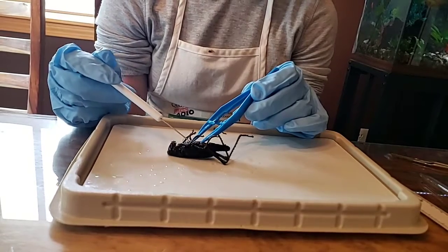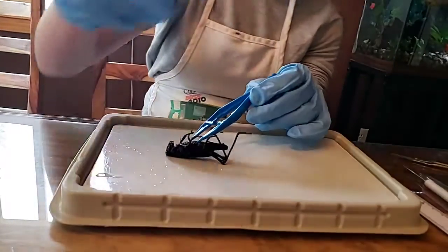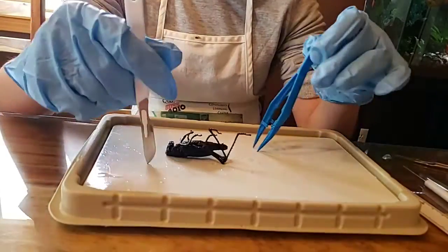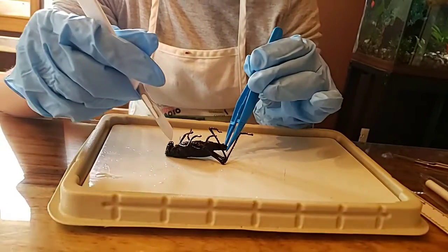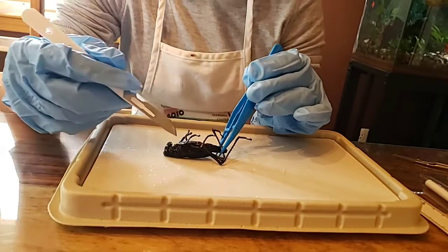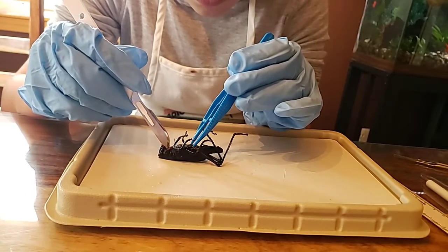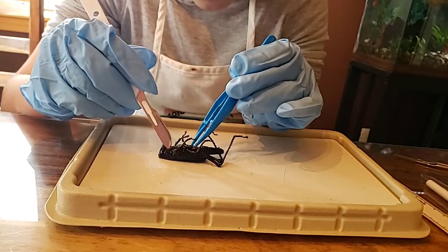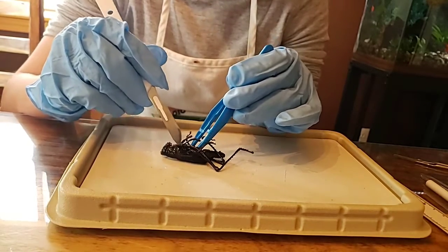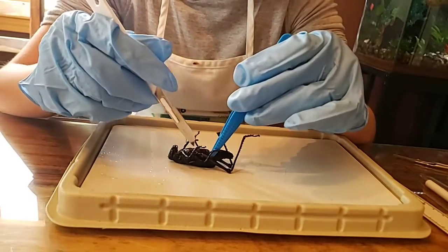Use scissors to cut through the exoskeleton of the ventral side from the head all the way to the posterior end of the abdomen. I would recommend using your scalpel. Scissors don't work great, but don't dig in too deep, guys, because you don't want to cut its intestines. Yep, you're going to cut from the head to the posterior end of the abdomen. Don't cut too deep, though. You're going to cut through 2 sections: its thorax and its abdomen. You'll partially be at its head, but you don't need to cut its head open yet.